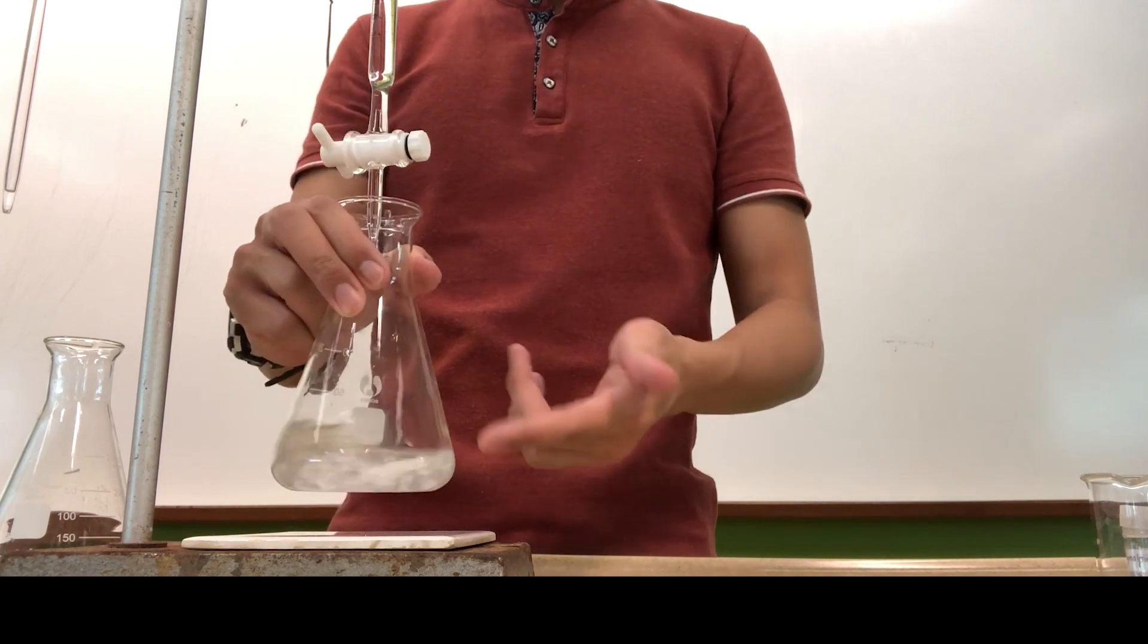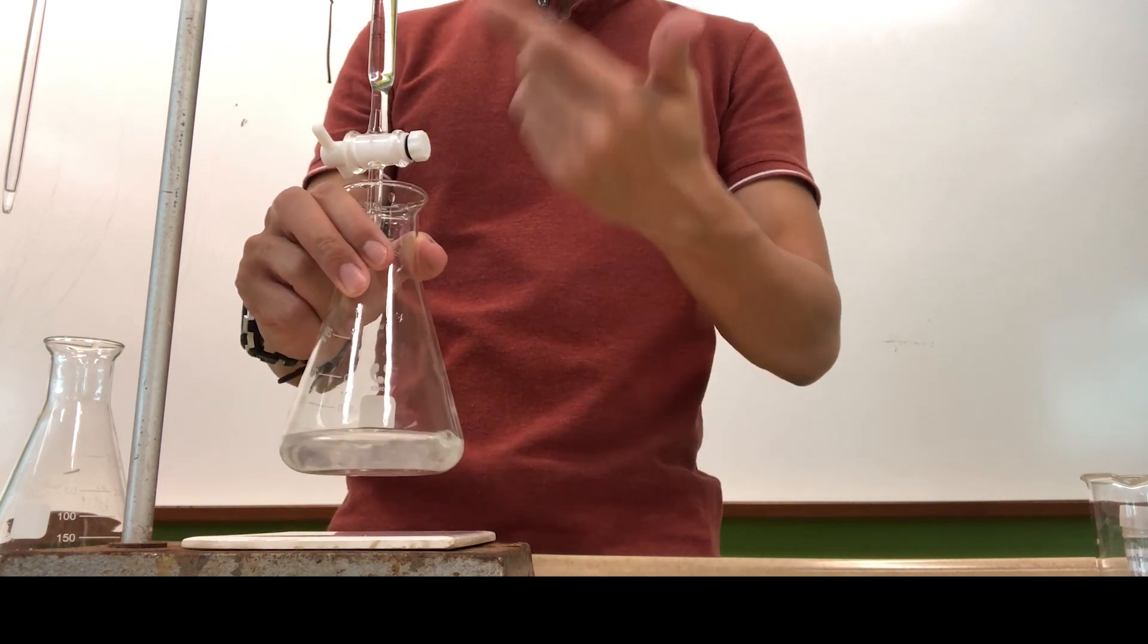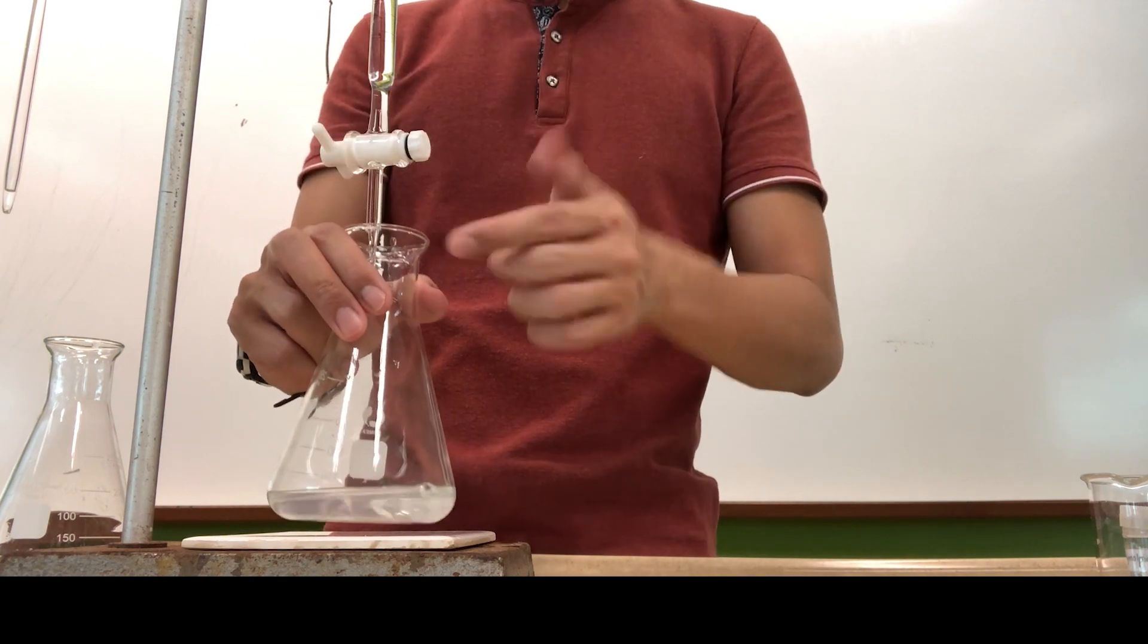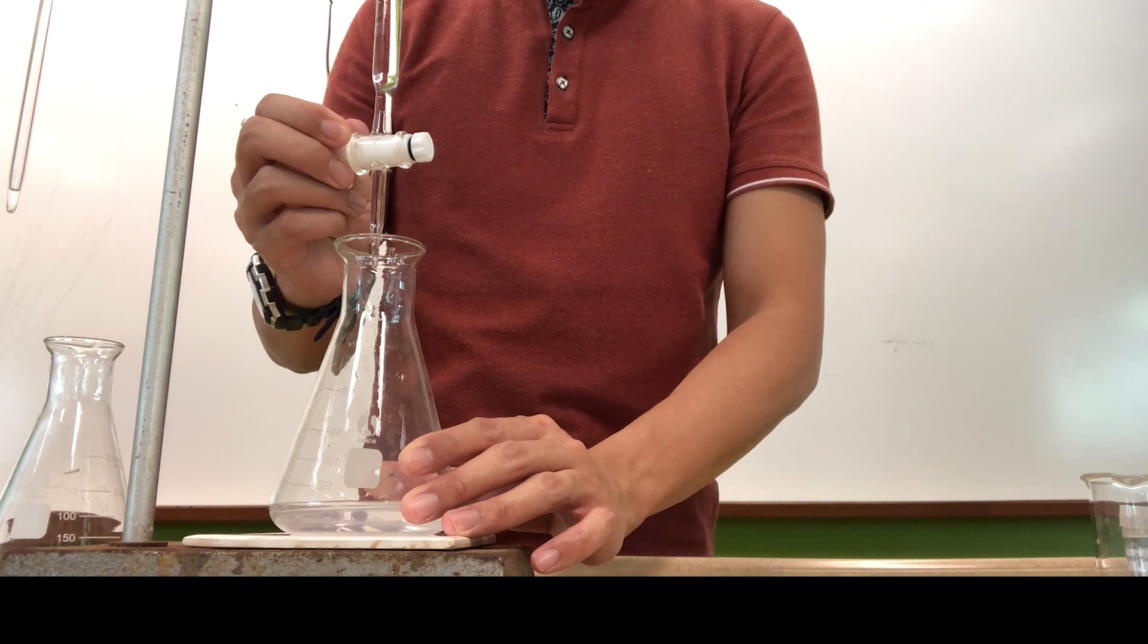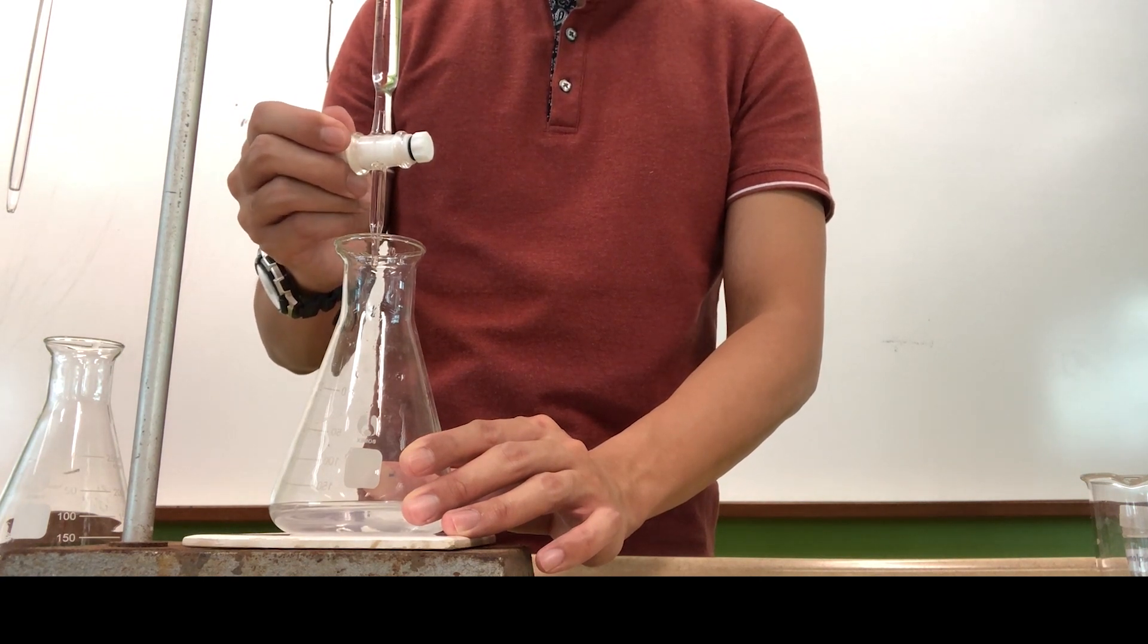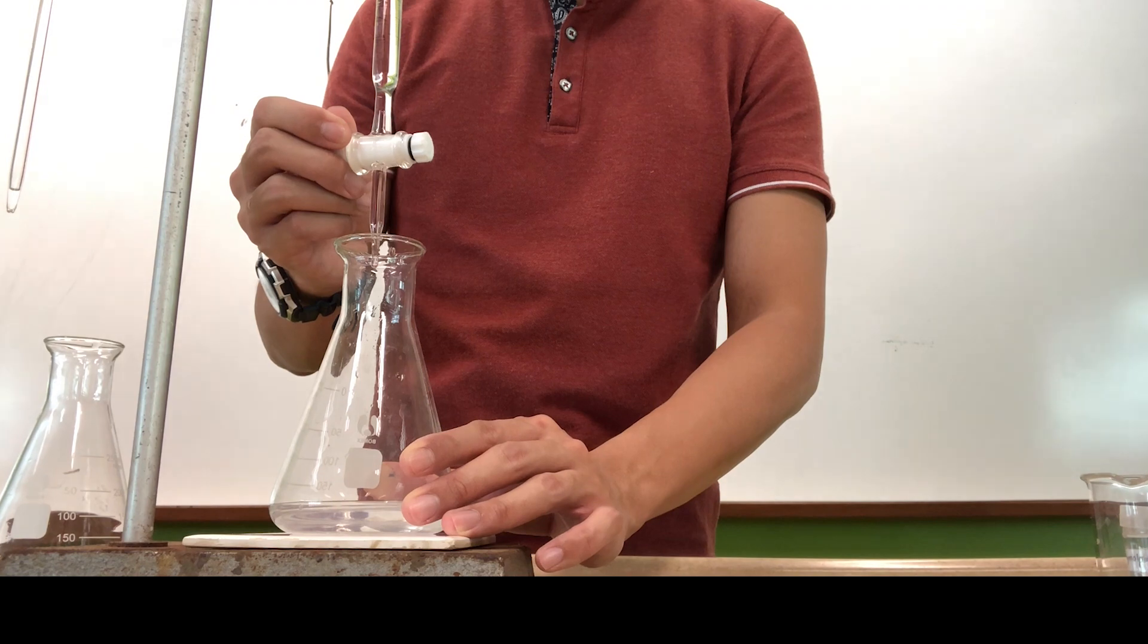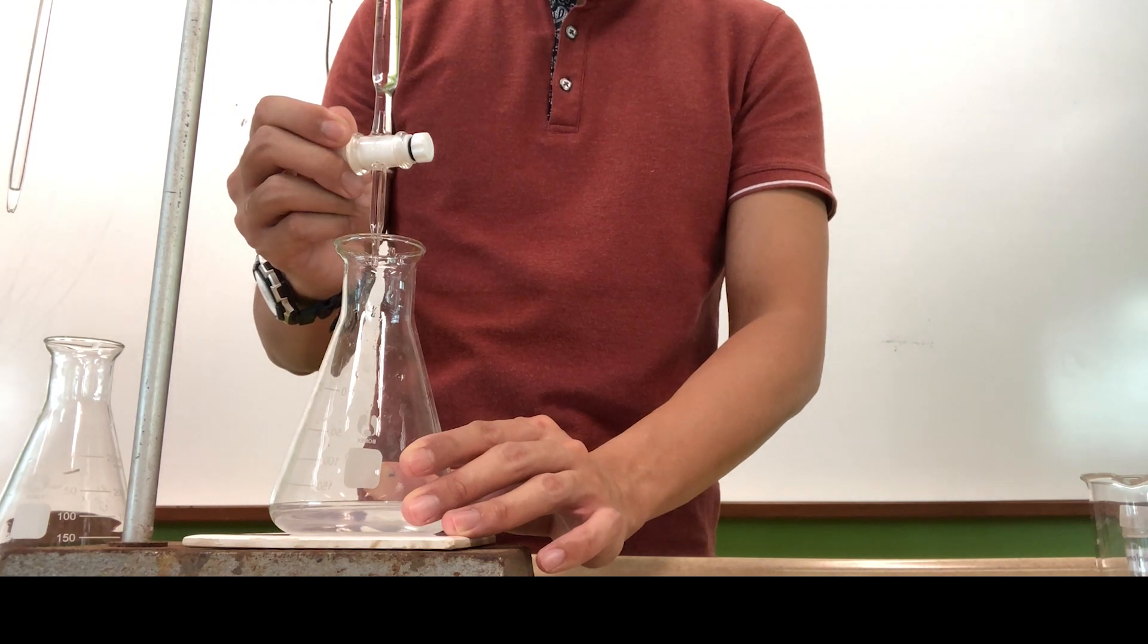Instead of dispensing all the solution at the start, what you should try to do is to actually try to figure out how to add in dropwise amounts of solution. Because at the start, you have the liberty to adjust the volume accordingly until you figure out what is the angle of the knob that can give you the dropwise addition.